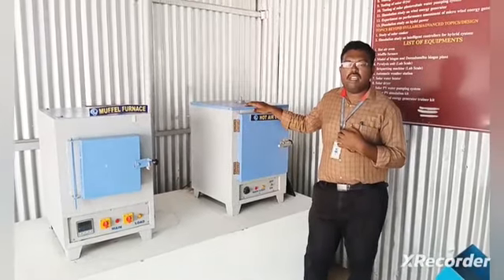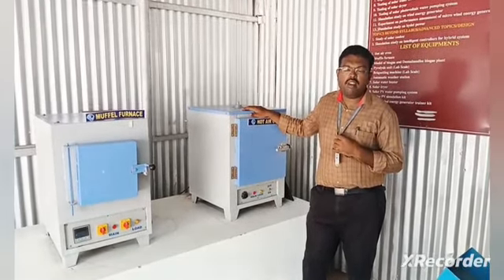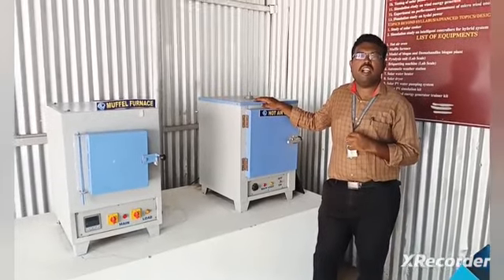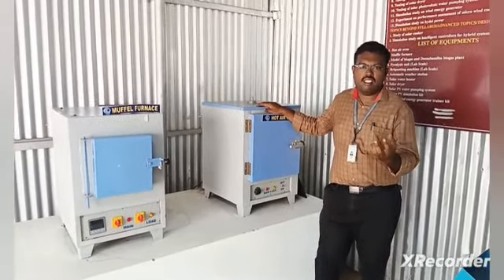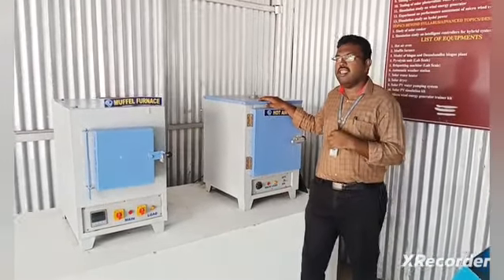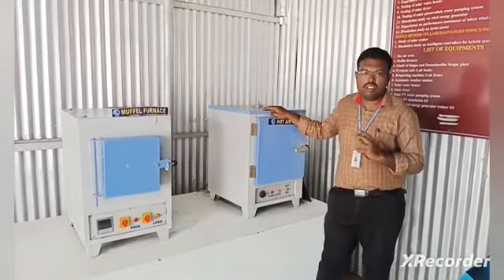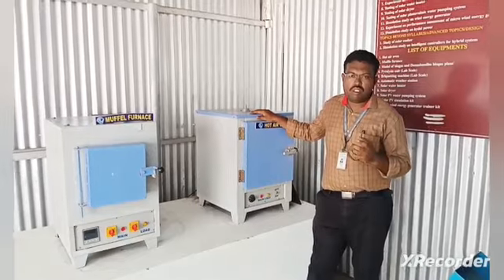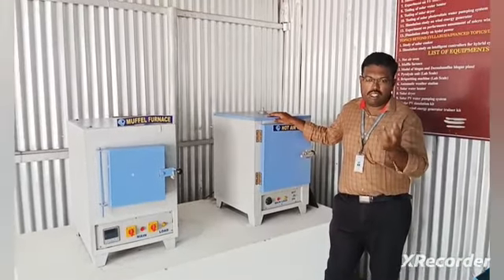For example, if they are giving you coal, we are going to calculate first the volatile matter. In this, we are going to calculate how much moisture is there in that coal. After that, how much ash content is there. We are going to calculate both of these. Why do I want to calculate this? If you calculate this, we can find out the quality of that biomass.